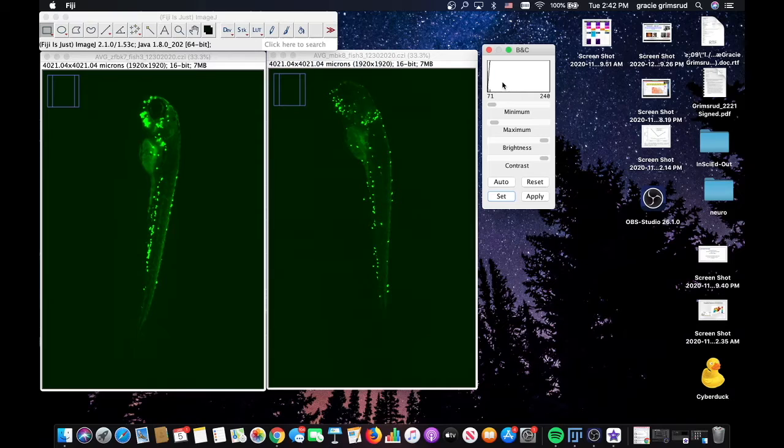This is important because the amount of fluorescence that can be seen with the human eye may impact how you draw your boundaries when measuring the fluorescence. That is why we want them to be the same, so that it leaves as little room for human error as possible.